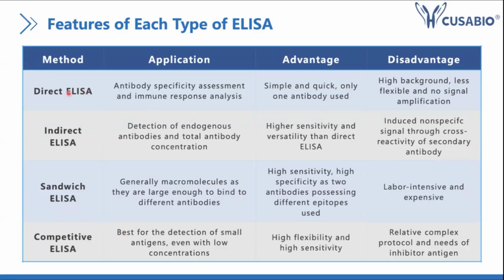So overall, I will say that they are all very helpful. Based on what you need and your experiment, be sure to choose the appropriate ELISA to work with, because you see the complications are slightly different.